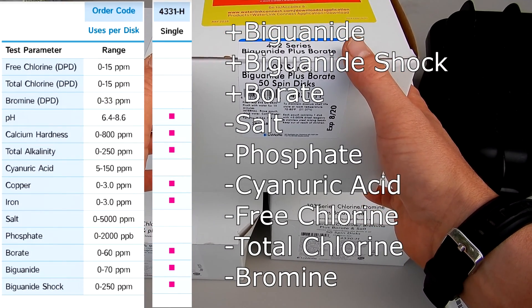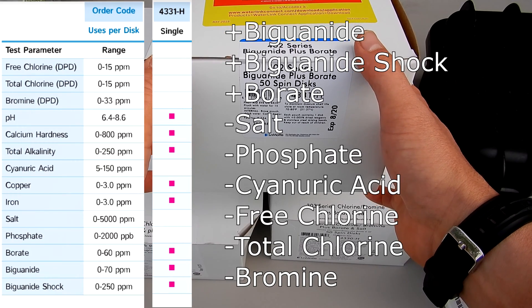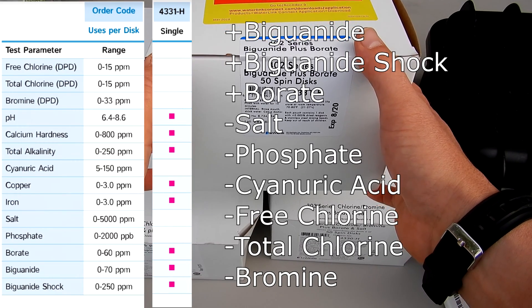Then you have the 402 series, the 4331-H. It does all of these test factors, plus biguanide and borate.